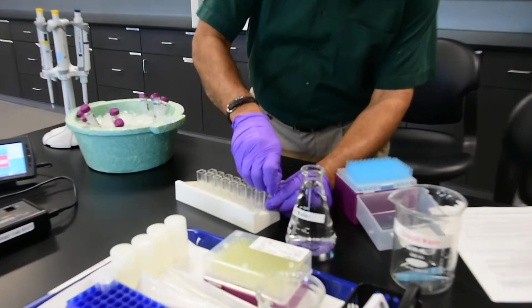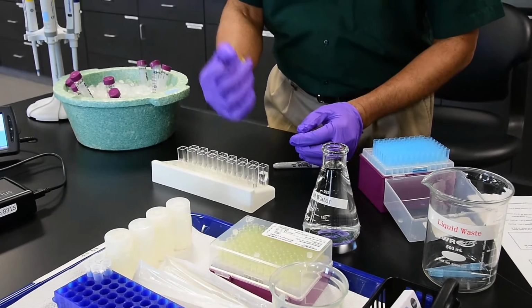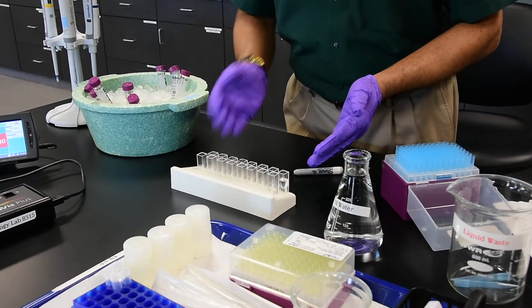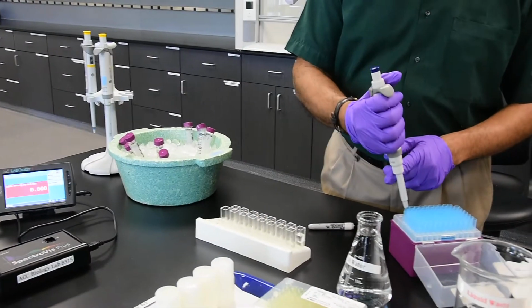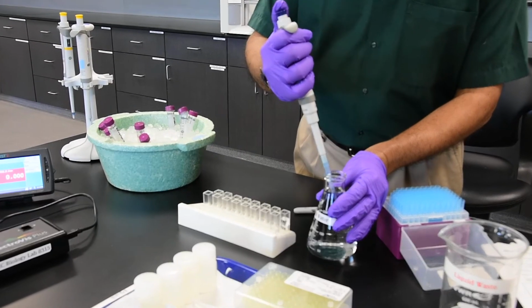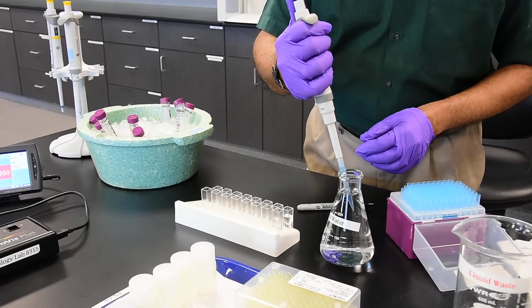So the next thing I have to do is to move 1 milliliter into the next cuvette. I'm going to add 1 ml water to each one of them now, so that it's easy to mix, move, mix, move, mix, move like that. So I'm going to add 1 ml water to each one of the other cuvettes, then it becomes a lot easier.